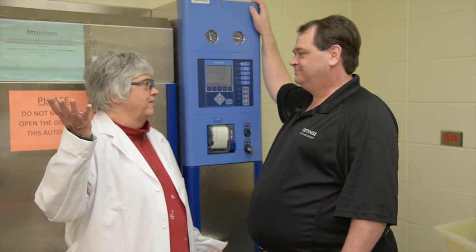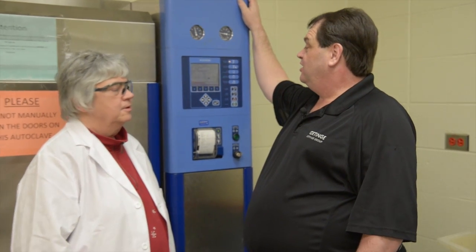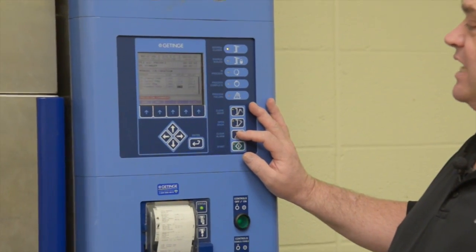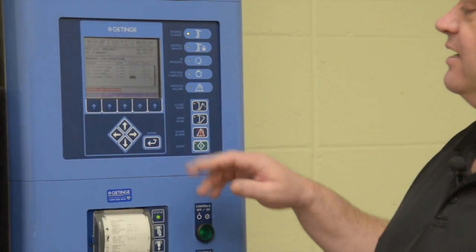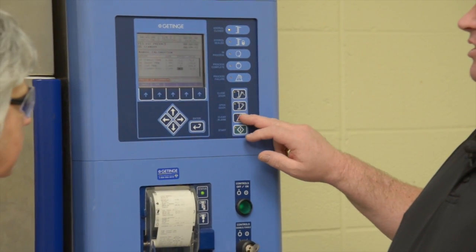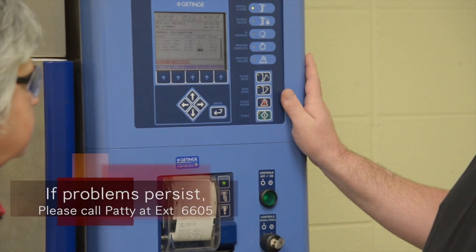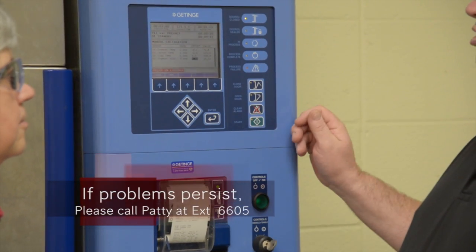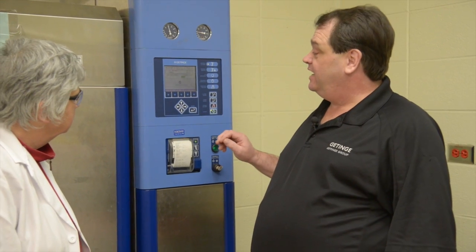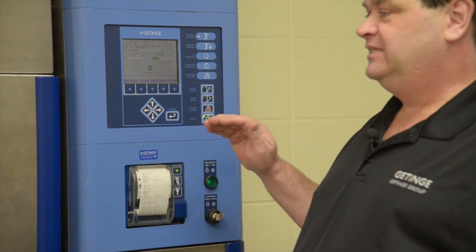What do you do if the alarm goes off? If you get an alarm during a cycle or in standby, first hit the clear alarm button. The chime will stop but the alarm indicator may still be there — that's caused by a fault that is current. If the fault is current you can't clear the alarm until the repair is made, but at least you were able to silence the machine. Once the repair is made the alarm will go away and the sterilizer is ready to be used again. If you push the button and the indicator and alarm go away, it means the fault is not present at this time.